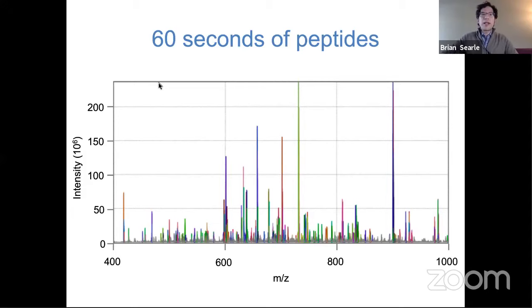So just in that one batch, I took this 60 seconds of peptides and highlighted every precursor that had a total integration above 1E7. And this is on a Q Exactive, so 1E7 is a very high intensity. That's a very confident intensity that you would trust.